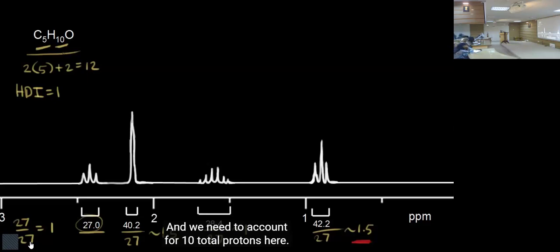And when chiral centers are present, each proton behaves differently. Its magnetic environment becomes different. So you can easily identify, because then we have a spectrum with at least one proton signal, most often in natural products.